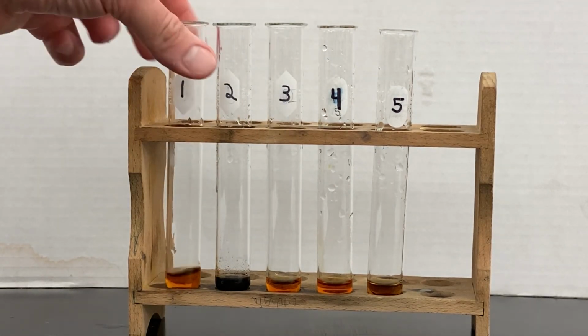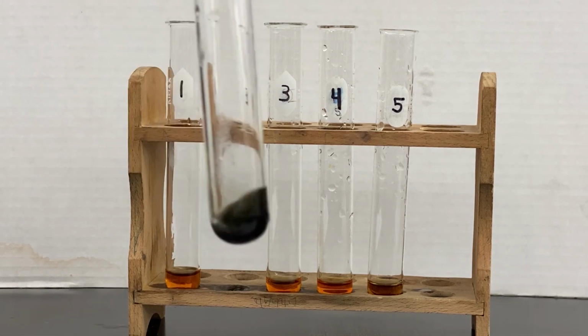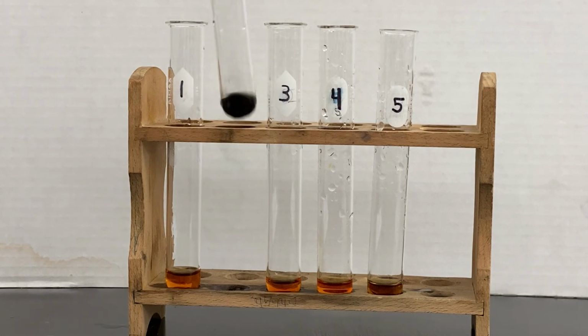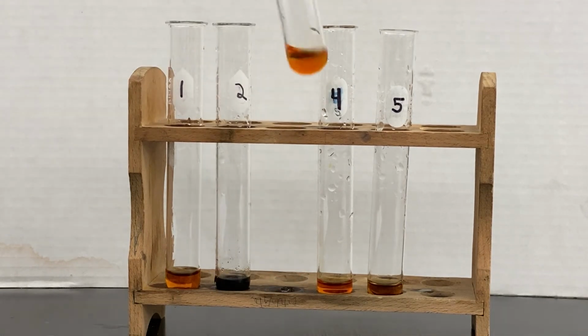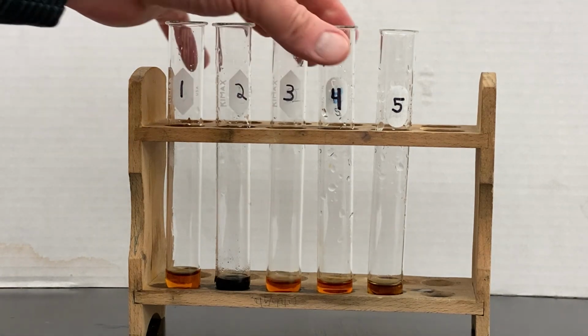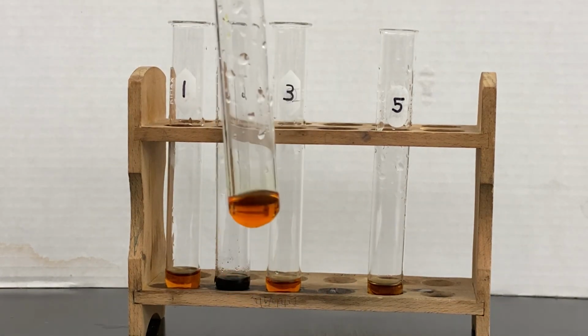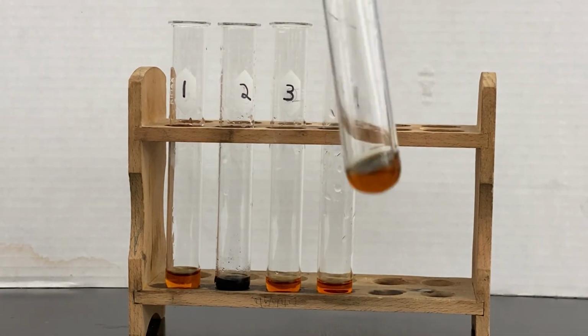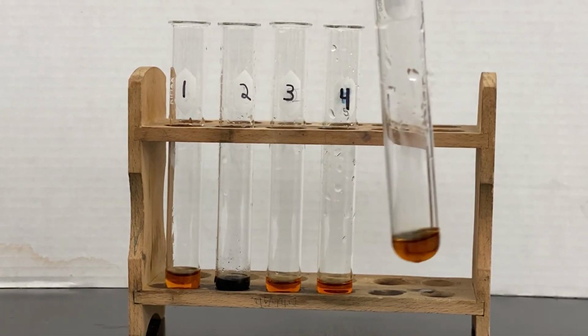No change in test tube number 1. We have a pretty pronounced positive change in test tube number 2. No change in test tube number 3. No change in test tube number 4. And number 5 is kind of a mix.